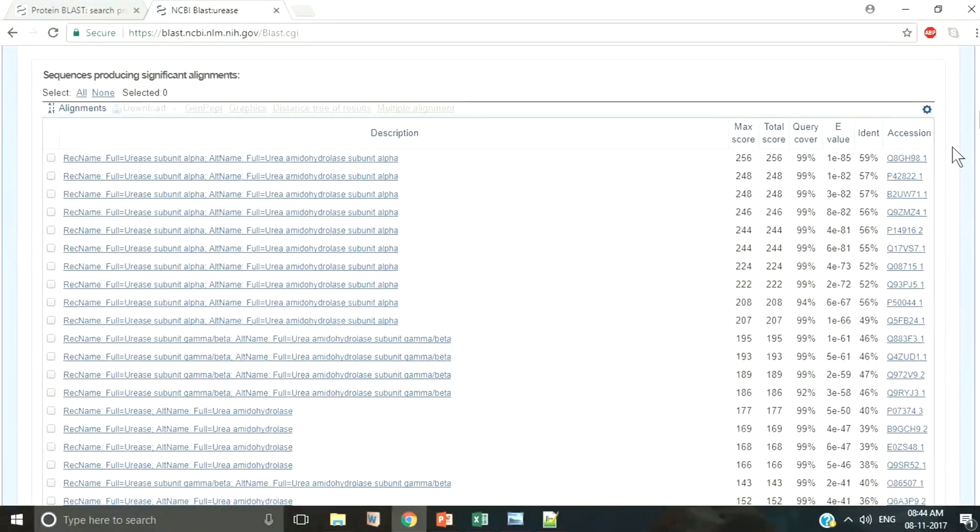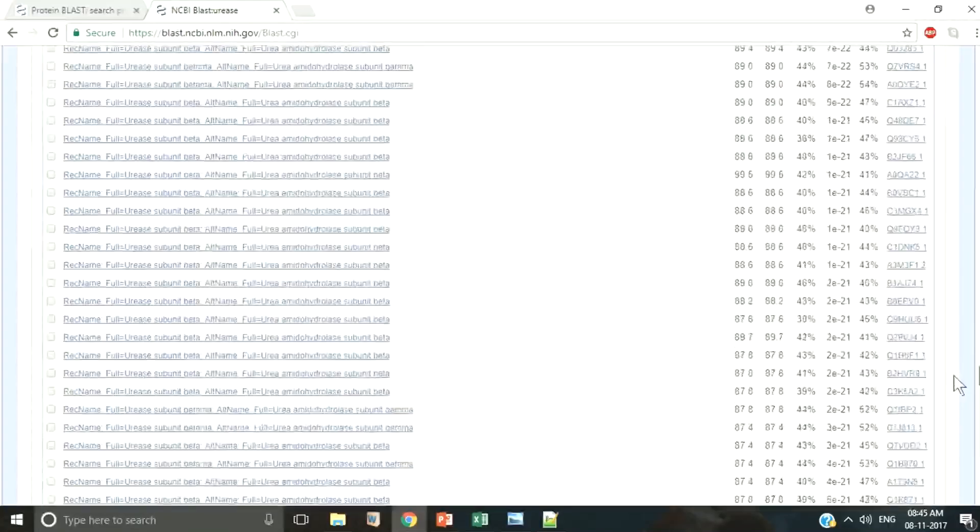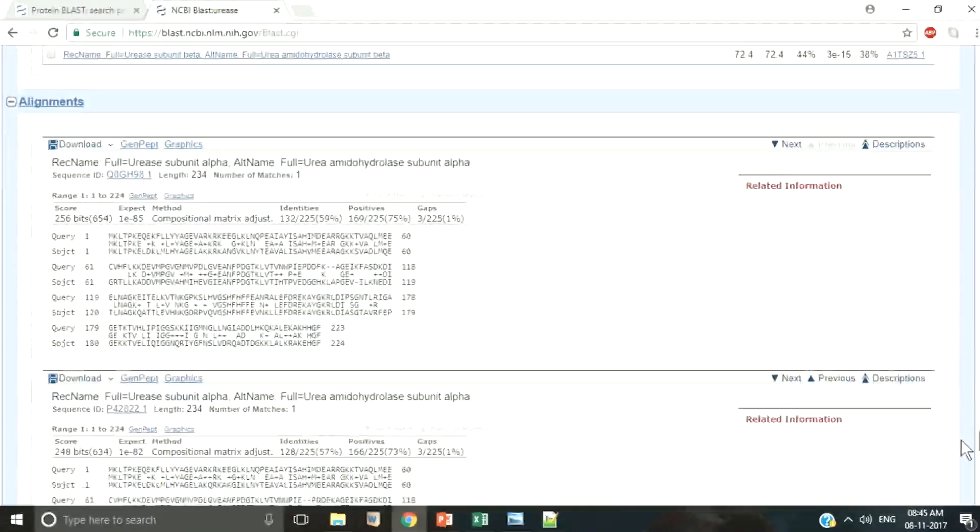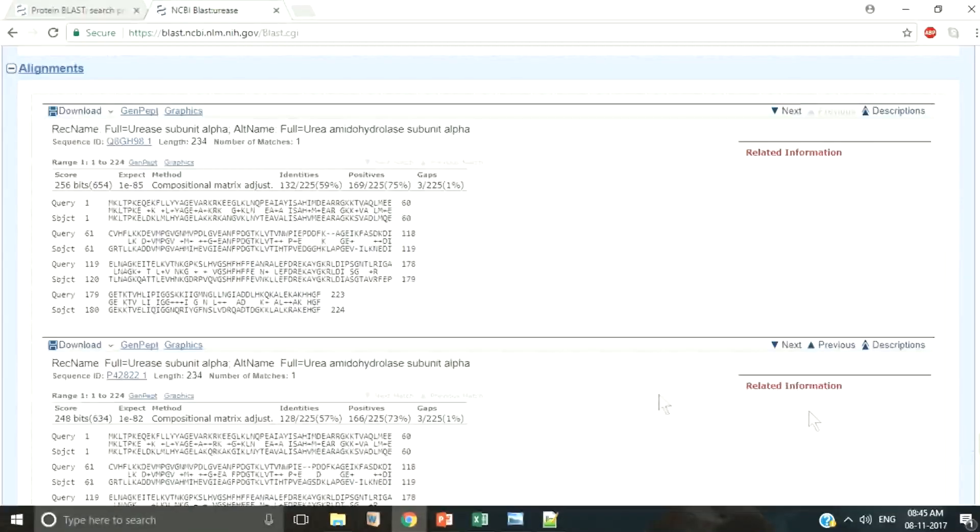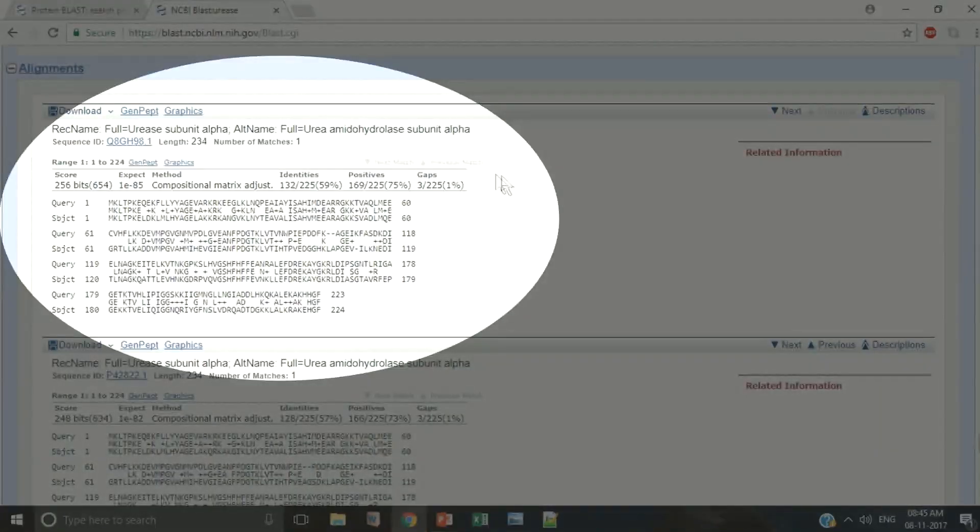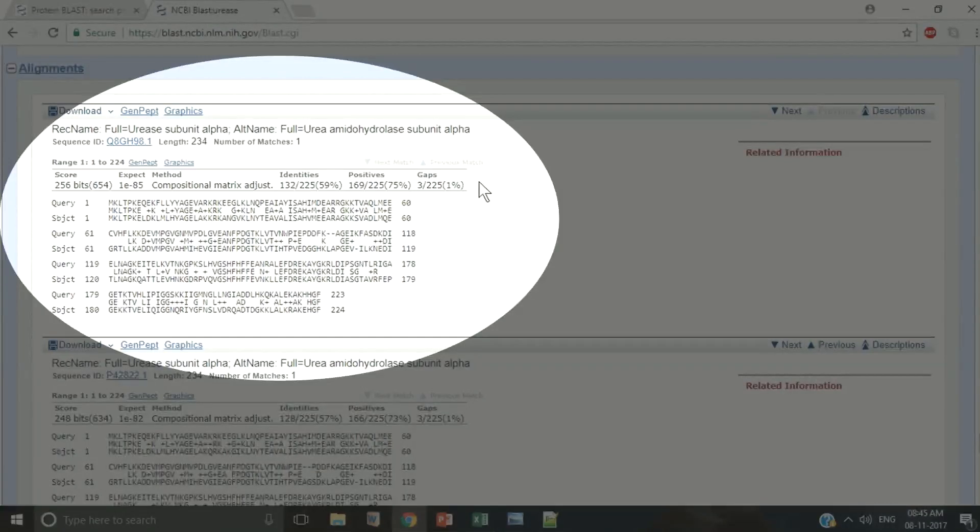You can see the alignment lengths, alignment scores, and sequence identity here. And finally, there is a section showing all the alignment blocks for each BLAST hit.